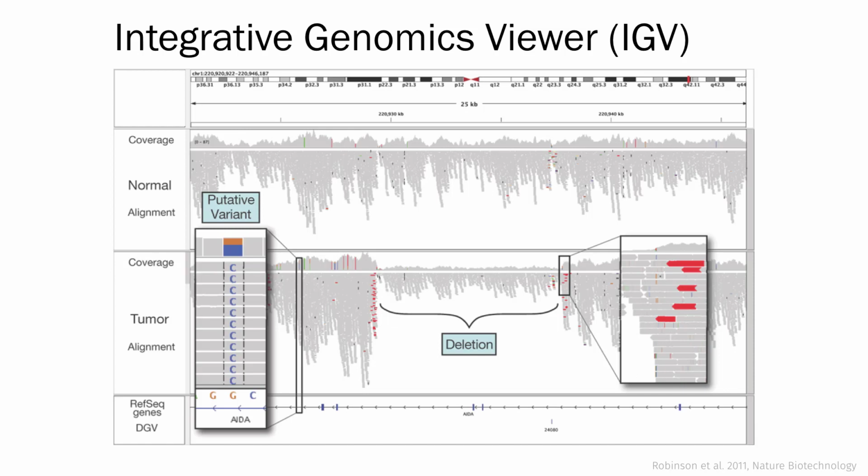And the reason why I'm showing you this is, here you see really individual nucleotides and SNPs, variants in sequencing reads that are mapped to the genome. And the interesting thing here is very clear when you see patterns like this, when you map sequencing reads, there's potentially a deletion here in a genome. In this case, they were able to confirm this by looking at some paired reads that are found on both sides of this deletion.